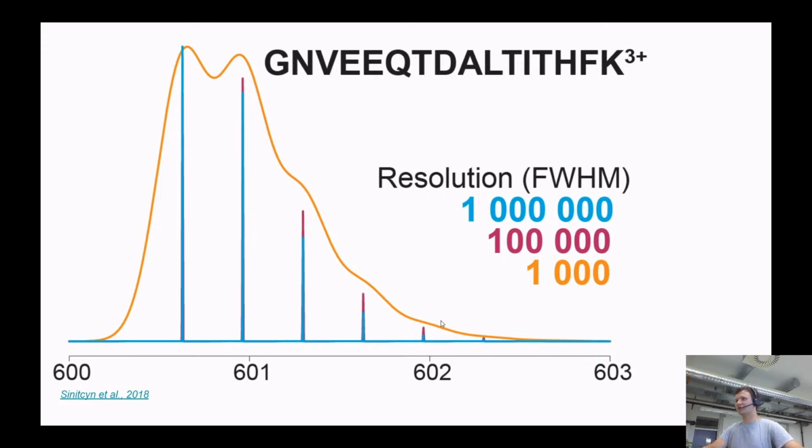The reason is that it's carbon which has an additional neutron. It's basically 12 plus one additional neutron. The truth is that a peptide is a huge molecule. We have a lot of carbons, a lot of hydrogens, a lot of oxygens, etc. As a result, the probability that you're going to have at least one isotope is not very low, in this case at least 1%. You may also by chance have two additional neutrons landing somewhere, or 3, 4 and 5, etc. This is actually what we see.